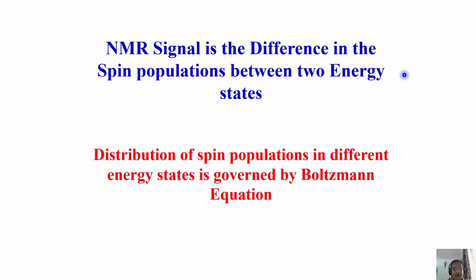Next, okay, we have understood something in quantum mechanics, spin physics. Classically, also we got the picture. We know it's a Larmor precession. Larmor precession increases linearly with the magnetic field. We also understood the sense of precession depending upon the sign of gyromagnetic ratio. It's fine. Now, all these things are fine. There is a difference in the energy, everything. But we need to detect the signal.